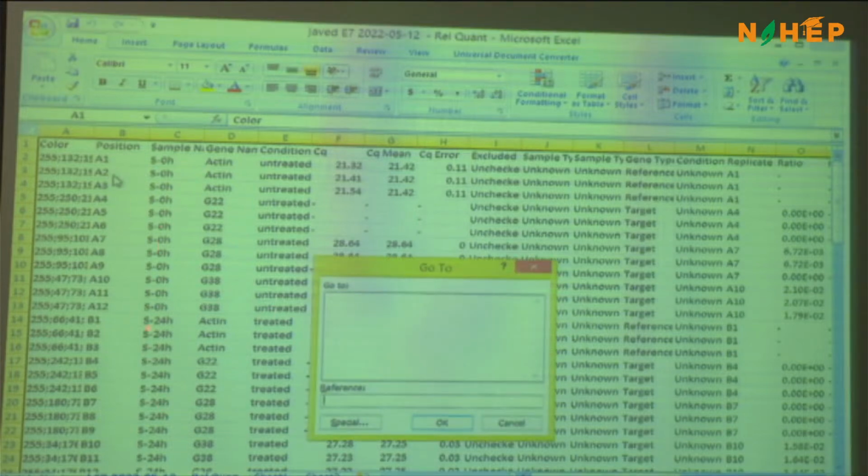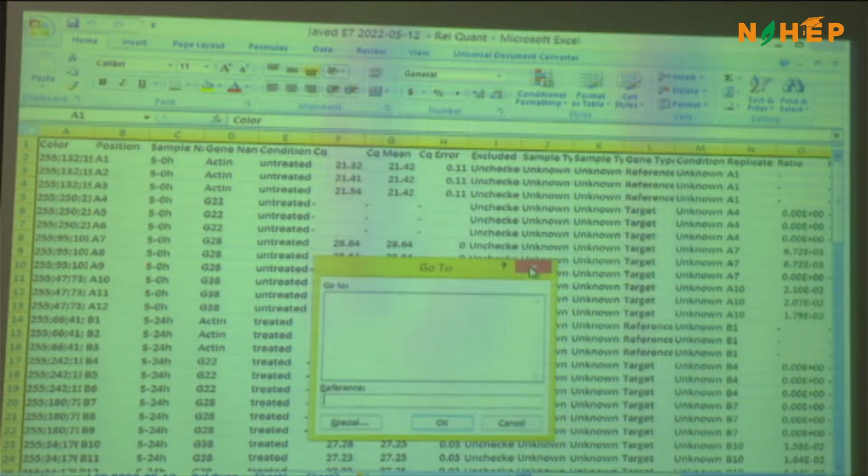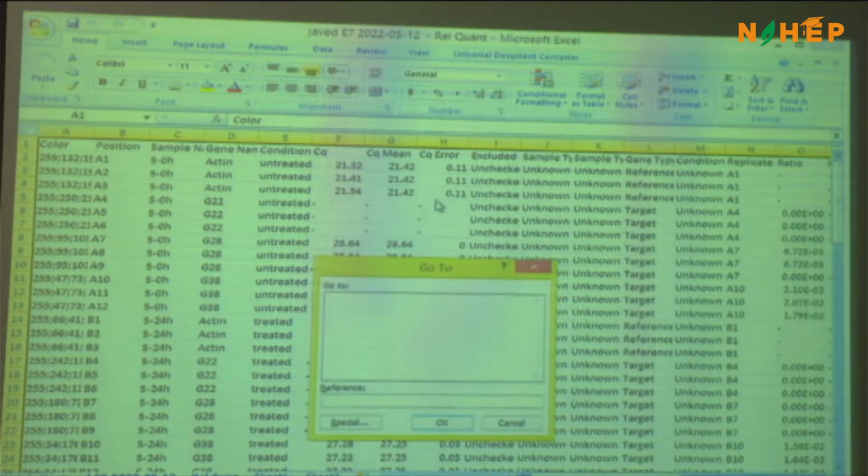Here, this is your time point. We used here our own data set, and this is the multiple time point, like yesterday we are using 0 hours, 24 hours or 72, whatever we have. Here, this is our time set.